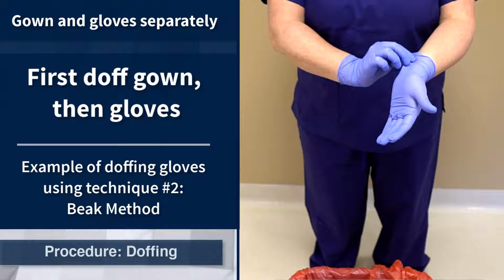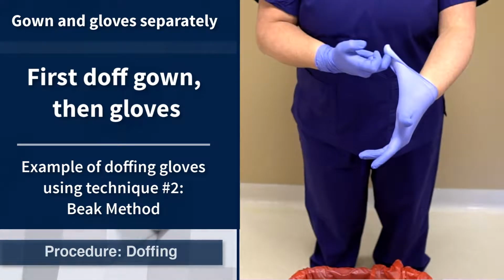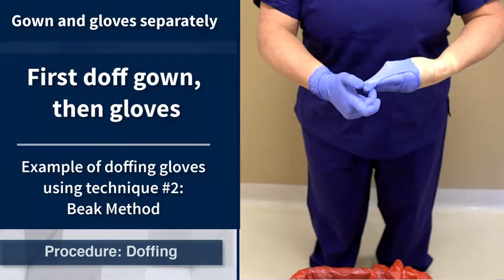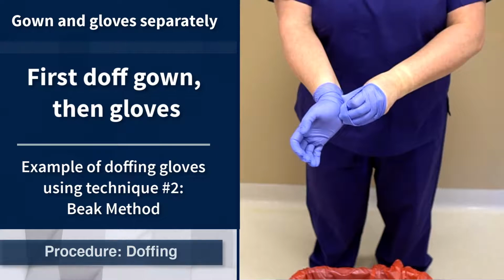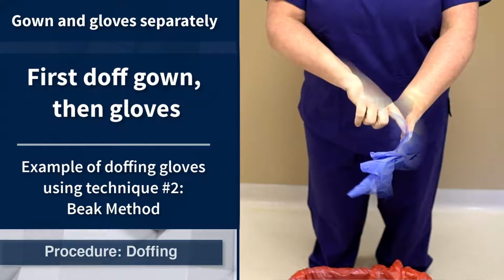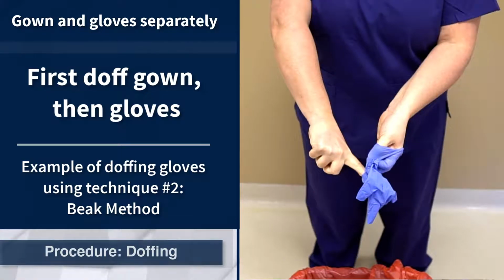Another method of glove removal is the beak method. Begin by pinching and pulling the wrist of one glove with a gloved hand, then, using a middle finger, scoop the cuff to pull the glove inside out and over the fingers and thumb to create a beak. Use the beaked hand to pinch the wrist of the other glove, pull it down and off. Slide the index finger of the ungloved hand into the inside of the glove and slide it off.